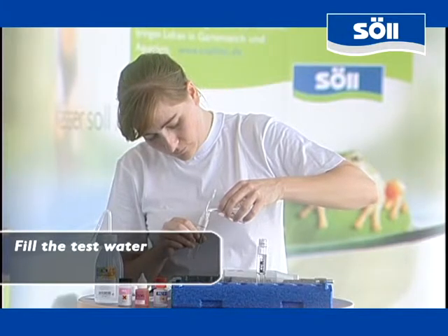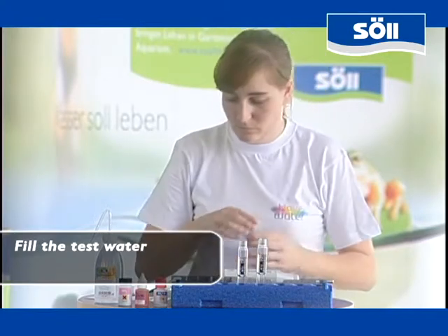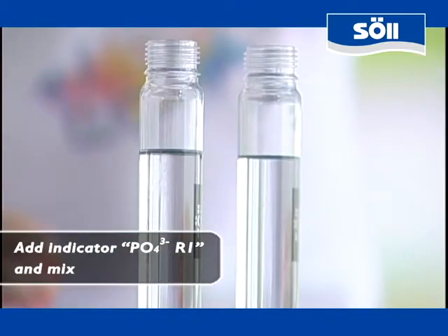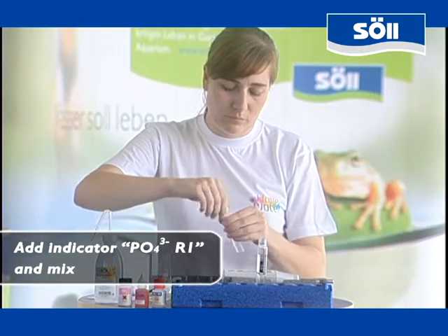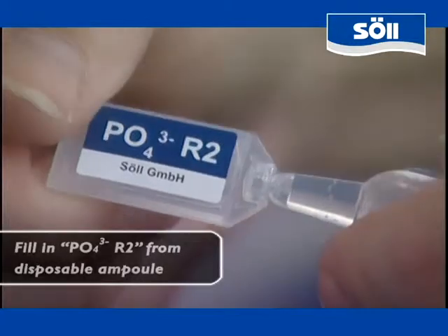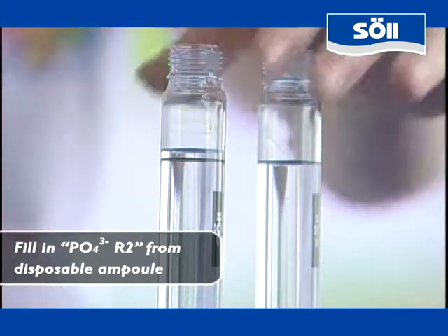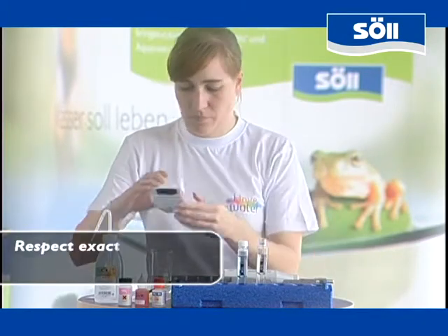Now we attend to the phosphate test. The same preparations have to be made: first you fill two sample tubes with the water you want to analyze. Unscrew the bottle with reagent number 1, R1, for phosphate and add 9 drops of this liquid to one of the plastic tubes. Then you mix the two substances. As two chemicals are required for the phosphate test, we have to fill in a second reagent, R2. Open the disposable ampoule carefully and then add the liquid completely to the same tube. Then you mix the liquids once again.